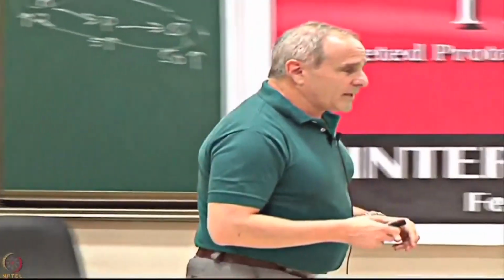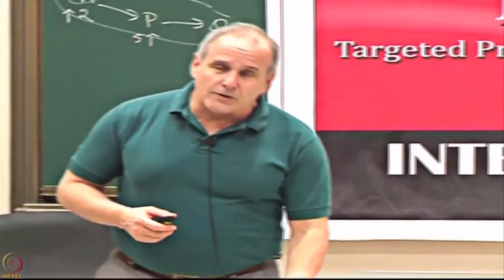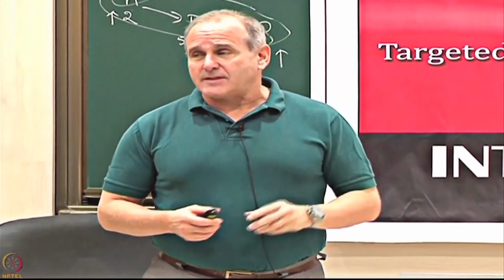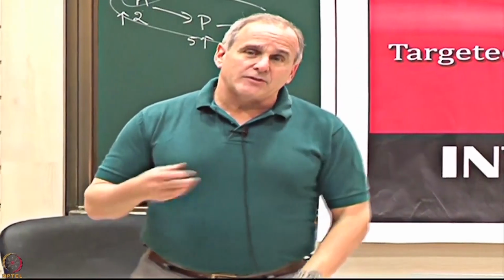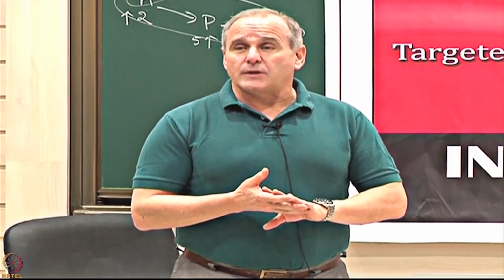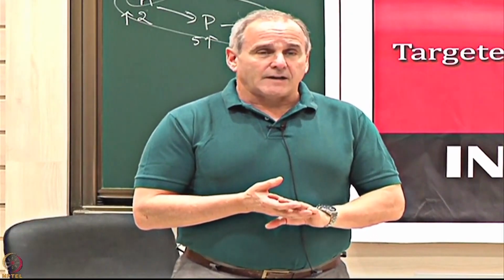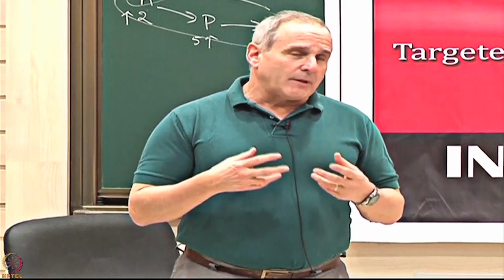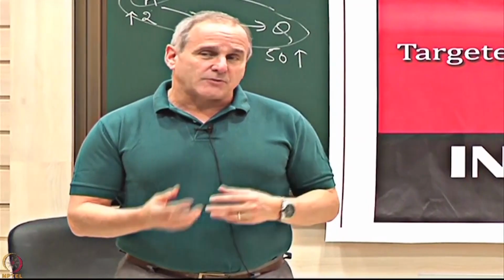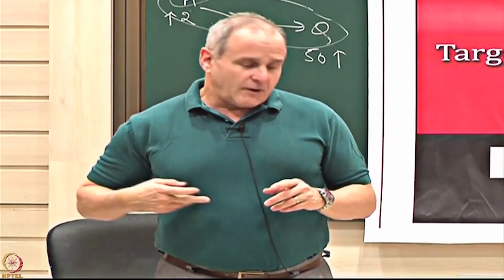The challenge with AMPylation is that we don't really know what the targets are. For years, people have been trying to study what are the targets that are being modified by these enzymes. When we began this work, there was probably one bona fide target that we really knew about. There were 2 or 3 others that had been proposed but not verified. The methodologies that people had used, they had tried doing pull-down experiments, they had tried doing mass spectrometry experiments, they had done various chemical linkage experiments, but it was very hard to figure out what the targets were.